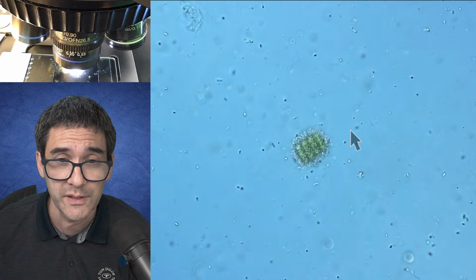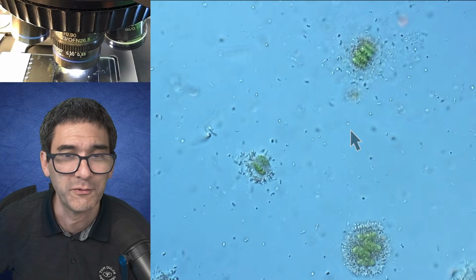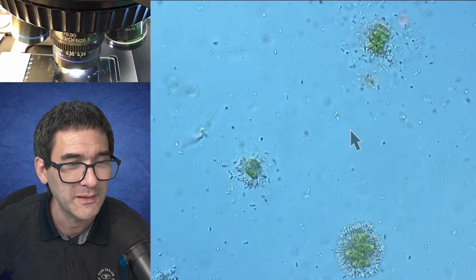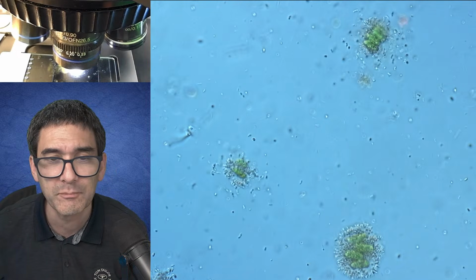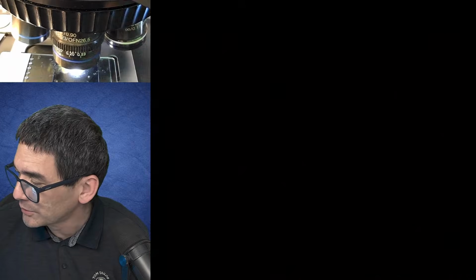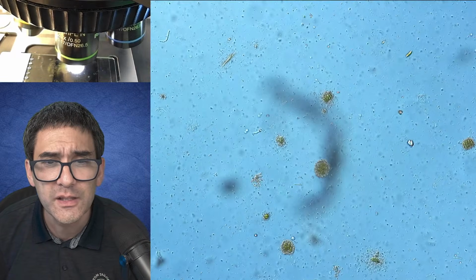Here again, also very nice. Look, this is actually pretty instructive as well. Let me remove this here again. Okay, so let's go down with the magnification. Maybe we're able to find something else that's interesting.